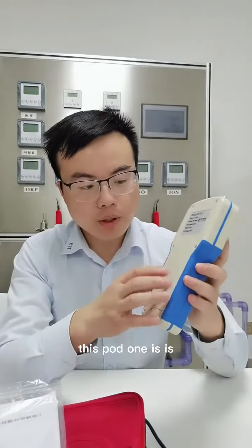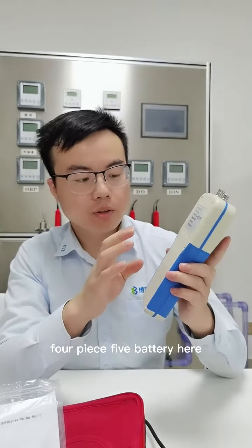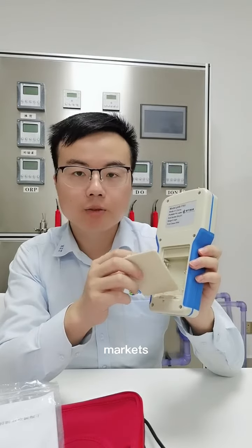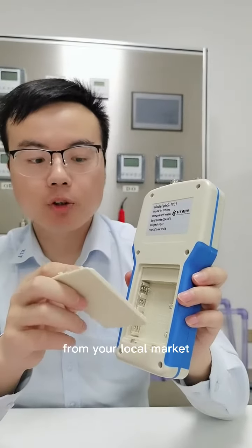And lastly, this portable unit is powered by battery — four AA batteries. For the international market, we do not supply the batteries directly, so you can buy them from your local market. That is fine.